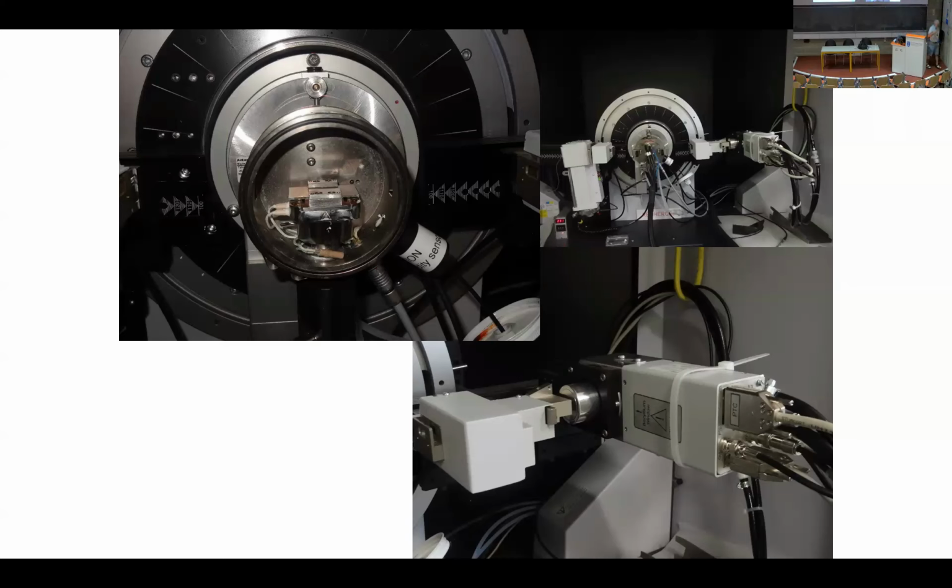Because if you record everything coming out from your sample, you will record what you are interested in, elastic interaction that gives rise to diffraction, with no modification of the wavelengths, but you will also record everything that goes with inelastic interaction with your sample. The first inelastic interaction you may think of is fluorescence.